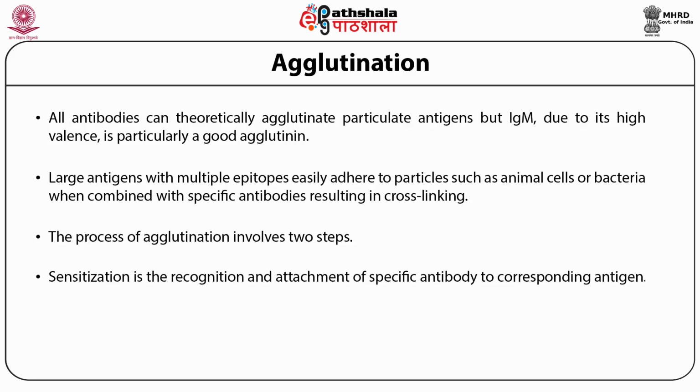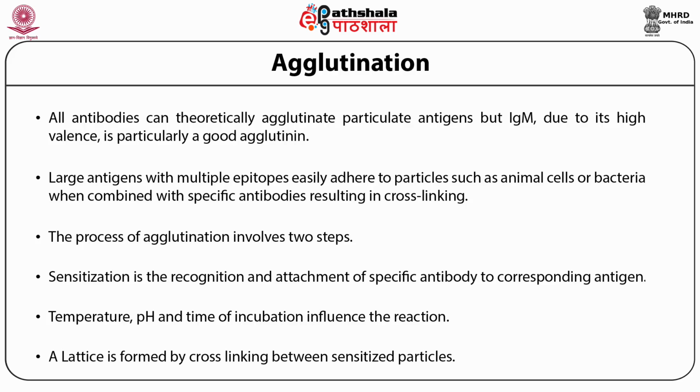Sensitization is the recognition and attachment of specific antibody to the corresponding antigen. Temperature, pH, and time of incubation influence this reaction. A lattice is formed by cross-linking between the sensitized particles.